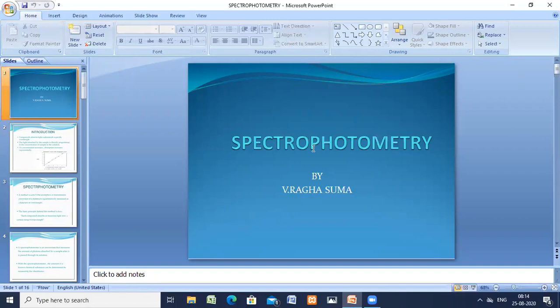What the wave theory tells us is that the propagation of light by light waves involves both electric and magnetic forces. Commonly, light radiation is referred to as electromagnetic radiation. You can see both the magnetic field and the electrical field components. The characteristics of this light are wavelength, wave number, frequency, and velocity. Spectroscopy has both absorption and emission spectroscopy.